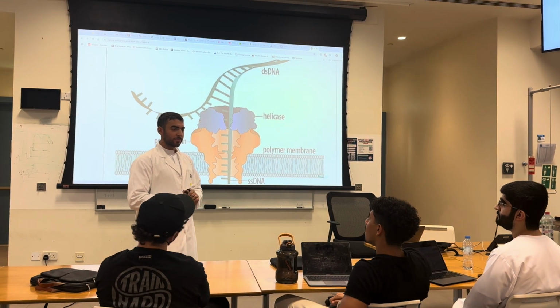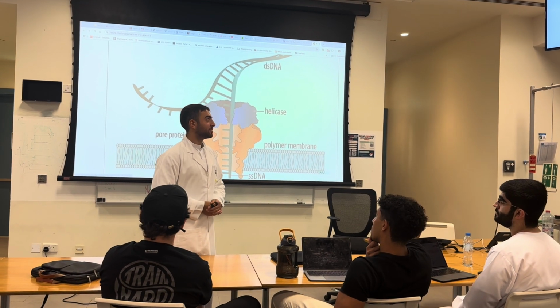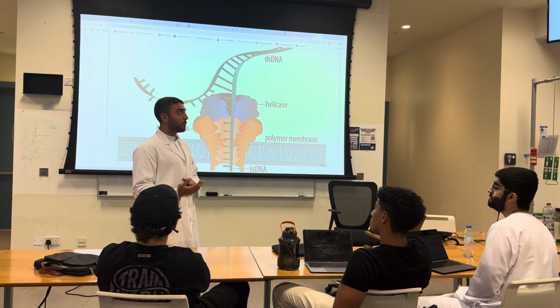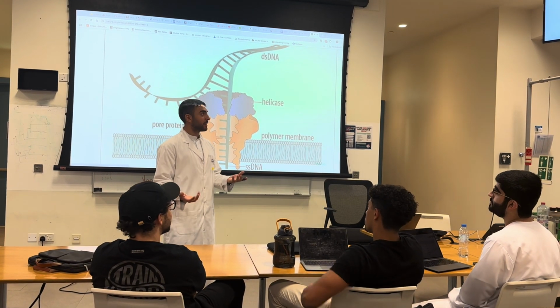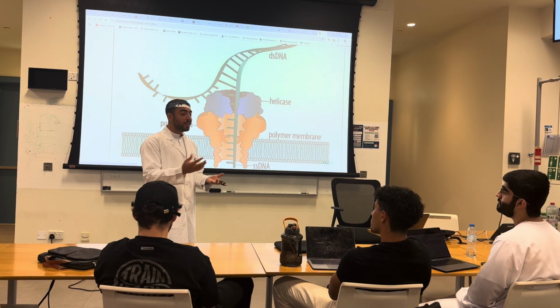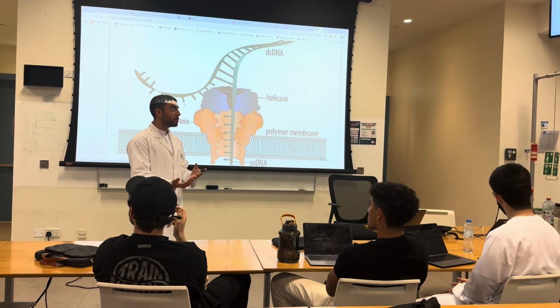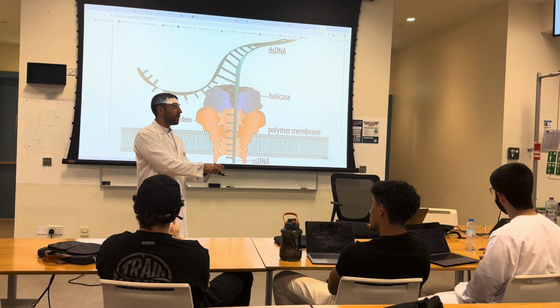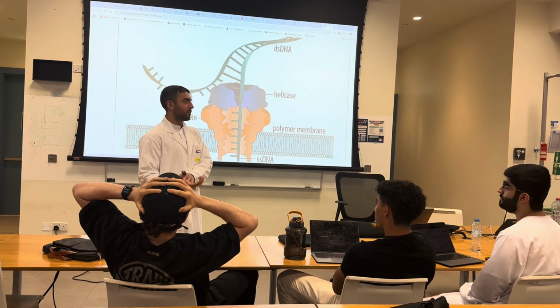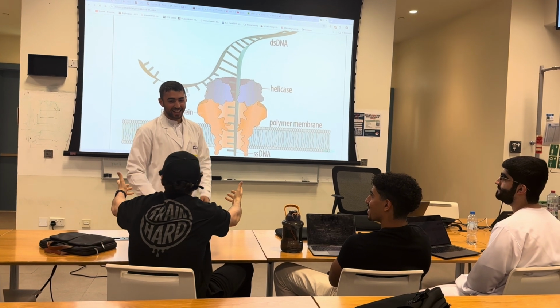Professor, could you combine nanopore sequencing with other sequencing techniques? That's a great question. We have developed something called hybrid nanopores, which are an innovative combination of biological and solid-state nanopores. In this design, a biological protein nanopore is embedded into a solid-state nanopore, which creates a hybrid system that merges the specificity and sensitivity of biological pores with the durability and stability of the solid-state nanopores. Sounds like the best of both worlds. It indeed is.